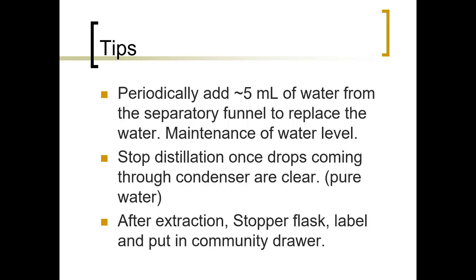After that, if you have time, you're going to do the extraction, but if you run out of time, then you are going to need to do the remainder of this lab and next lab in one lab. If you do, please label your stuff and put it in the community drawer.